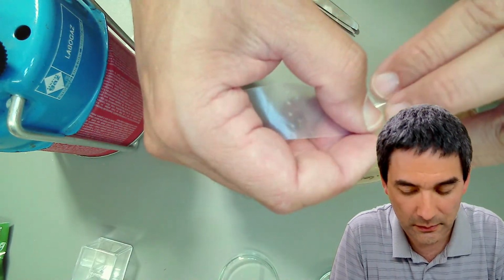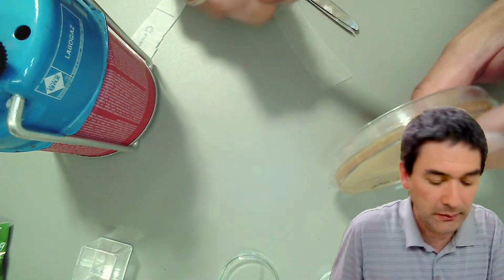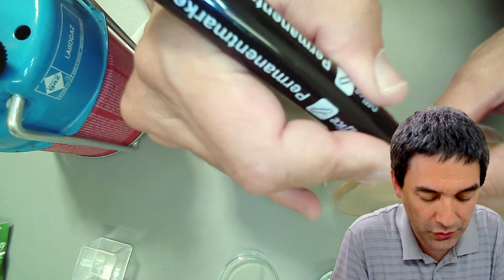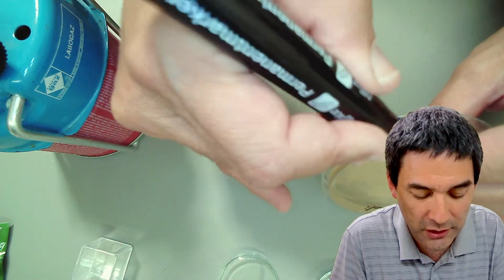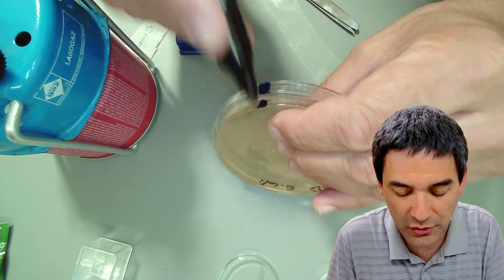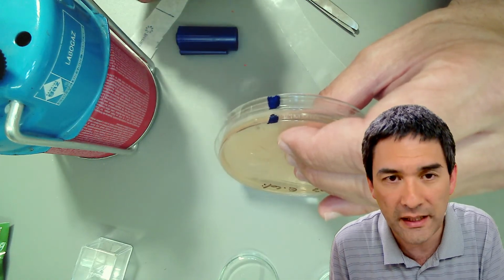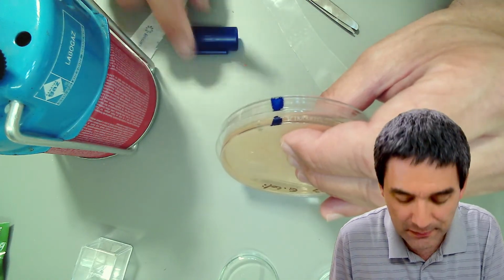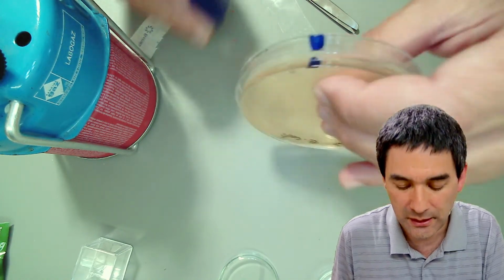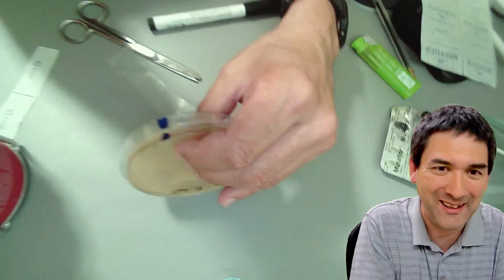And oh, I forgot to do something. I have to label this here. I'm just going to make a blue streak up here so that I know which type of medium it is. Now you see it, okay? In the lab, we always used to color code the plates, because we had so many different agar plates with different recipes. And that's also something I'm going to do here, simply to keep up the tradition a little bit.